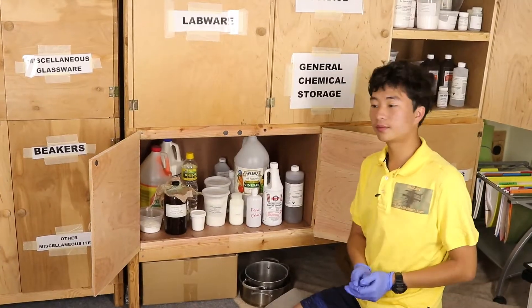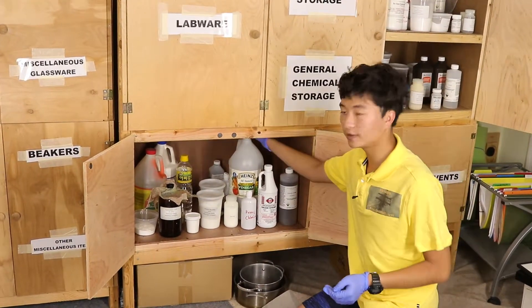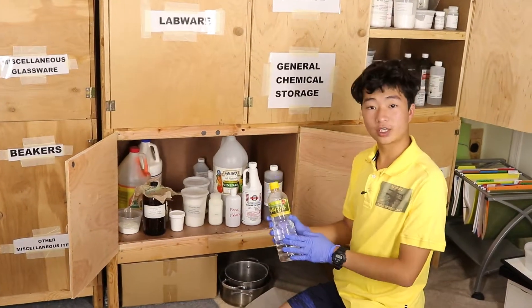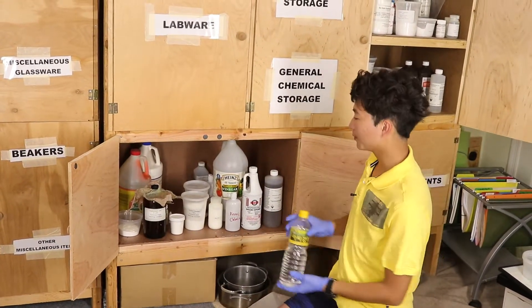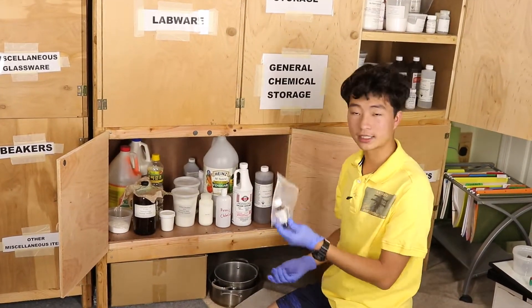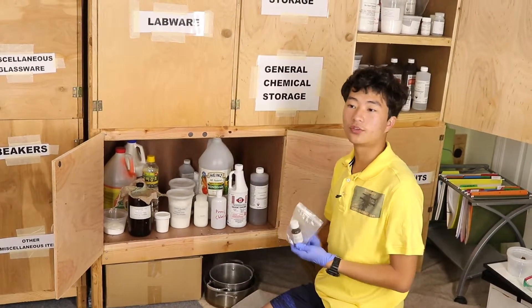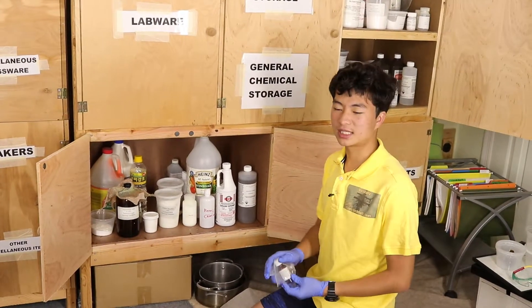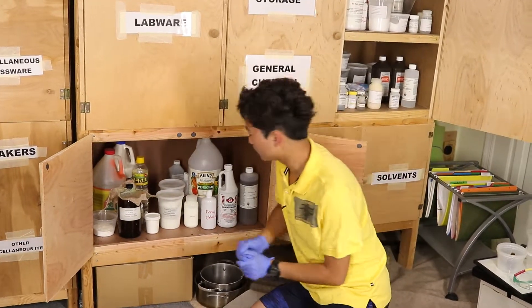Sodium bisulfate from pool pH decreaser — still technical grade but a good acid. Of course vinegar, because vinegar is an acid, and when visiting a multi-ethnic market I found 25% acetic acid. This bottle here is 5% — really cool — but for the hardcore people I have glacial acetic acid. What you might not know is that vinegar is super dilute; glacial acetic acid is really concentrated and quite dangerous in this form, which is why I keep it in a bag.